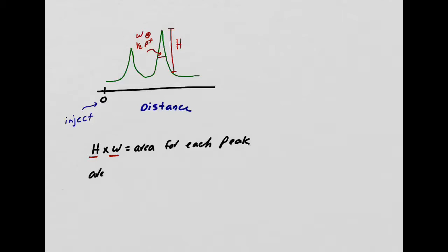The area under the peak is proportional to the number of moles. Right? We're doing chemistry. You've got to bring the moles out. So the area under the peak is proportional to the number of moles. So the molar composition can be approximated by comparing relative peak areas.